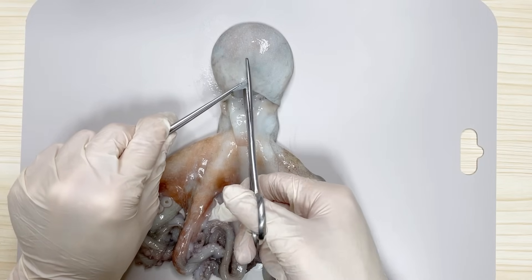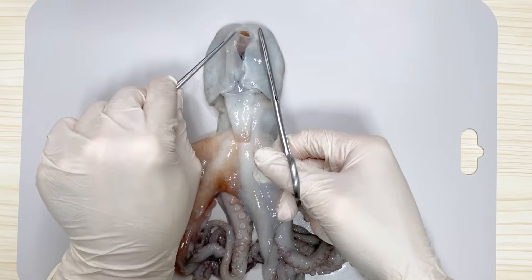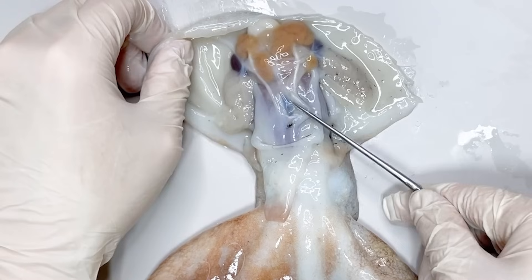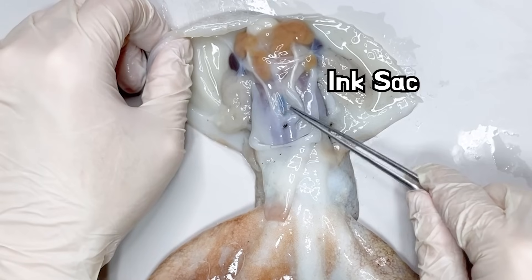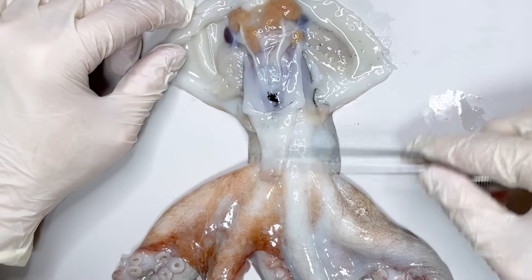Now, let's dissect the octopus. If we cut and spread open the upper part of the siphon, we can see the internal organs. First, if we press the black-striped area here, ink is released. This is the ink sac. It is connected to the siphon, allowing the ink to be expelled through it.